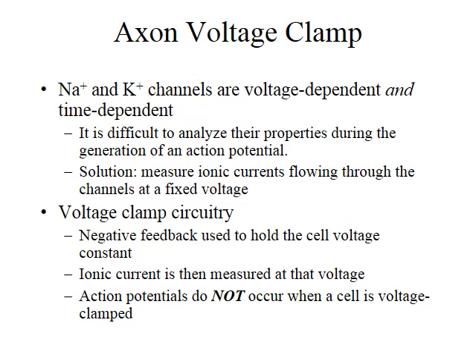The voltage clamp technique, which was developed in the 1940s, has been key to our understanding of how the action potential is generated. As we've seen, voltage-gated sodium and potassium channels, which are responsible for generating the action potential, are both voltage-dependent and time-dependent.